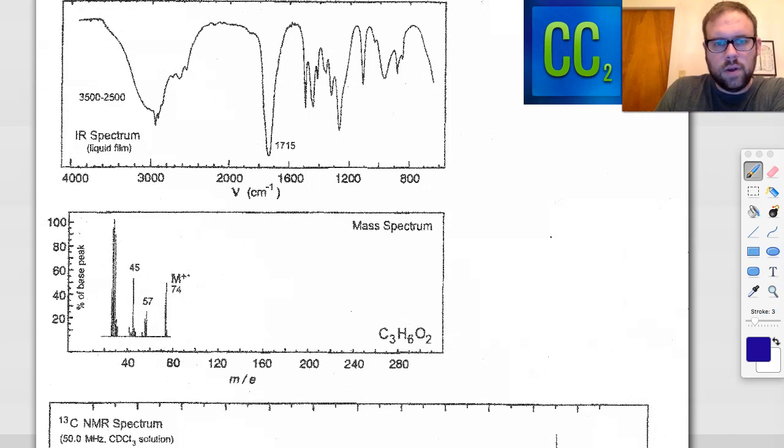Welcome back to another ChemComplete episode where we are going to be solving another unknown structure using spectroscopy. We'll go about this using our regular methods of degrees of unsaturation, mass spec, IR, and then the NMR data.